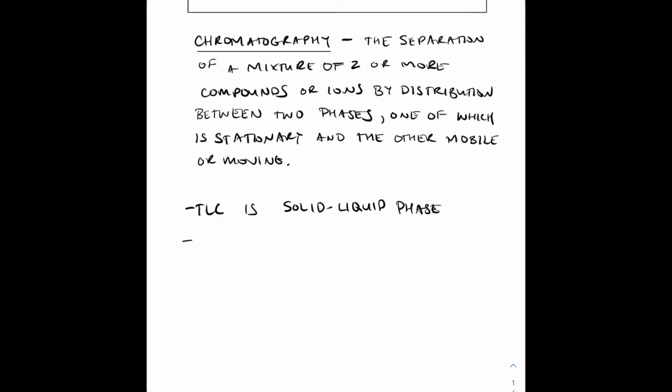Column chromatography and TLC are very similar in that they have generally similar concepts, but it's just the direction of the flow of that mobile phase: it's going up for TLC, and then it's going down for column.